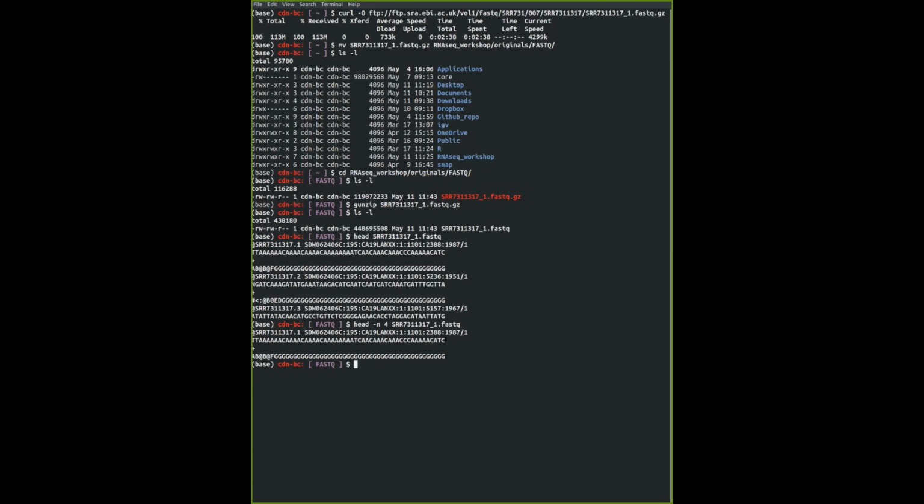I think if you're familiar with the Phred scoring system, this is exactly what a Phred scoring system looks like. I need to find the link to the scoring system. I'll paste it in later on. But there are certain ways for you to figure out which base is of low quality and which base is of high quality. Then you can decide how to trim your read to make sure that you are inputting good quality reads into downstream tools.